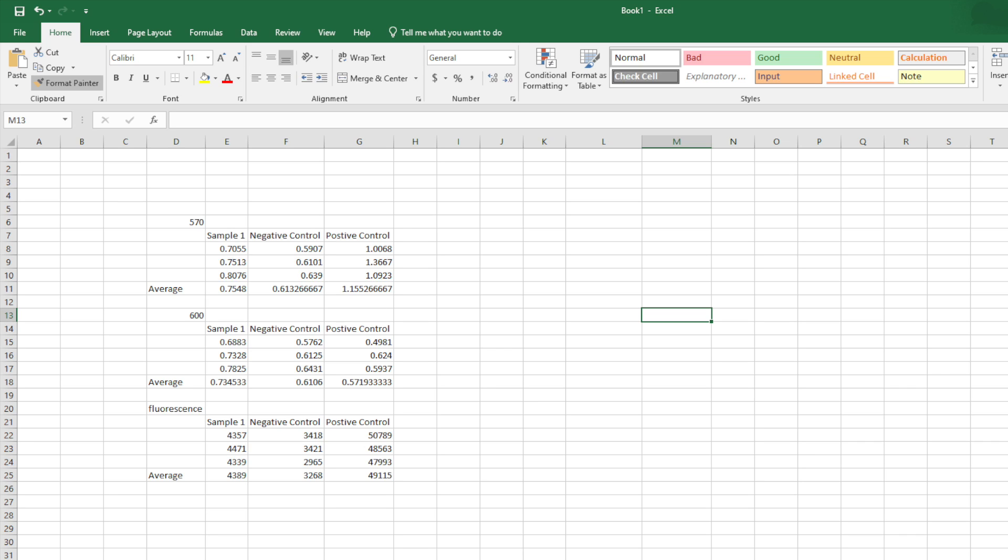Hello, my name is John Hunter Crum and in this video we're going to be showing you how to analyze your PrestoBlue data. On this slide, this is the data that you've taken from your plate reader and I've put it into a new Excel sheet so it'll be easier to manipulate.